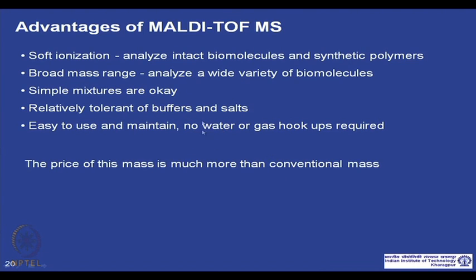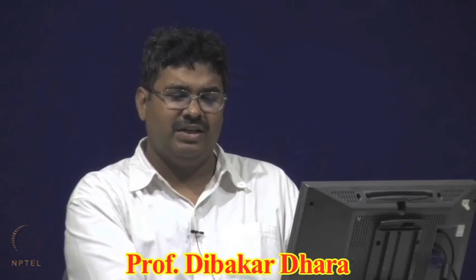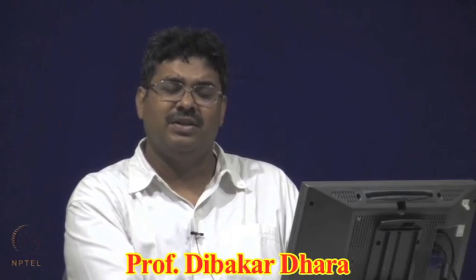Given all these benefits, the only disadvantage is that the price of MALDI-TOF is very high. So, it is not very convenient to use MALDI-TOF in every lab. With this we stop the discussion of determination of molecular weight, and we will move to the next topic in the next lecture.